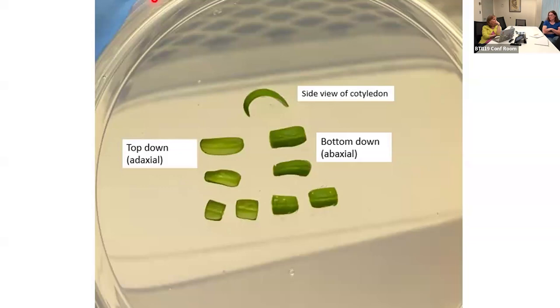I think sometimes with the acids, if the timing's off at all, you're really going to damage the seed more. So that one is a little, I don't want to say dangerous, but detrimental, yeah, it could be. Whereas the Rapidase, you don't really see that. So what Carrie mentioned is Rapidase.